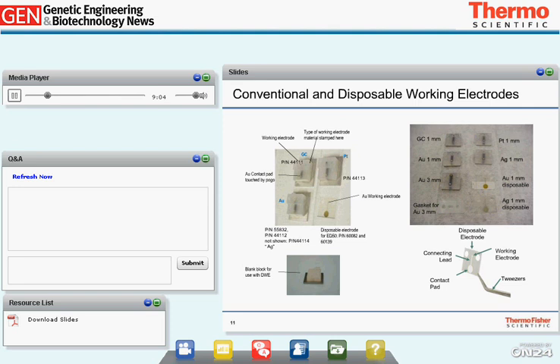The polymeric film is cleaned and dried. After assembling it with a stainless steel mask, we transfer it into a sputtering chamber. The chamber is then pumped down to a high vacuum. With argon plasma on, we start to sputter on a titanium layer. In the next step, we sputter gold.